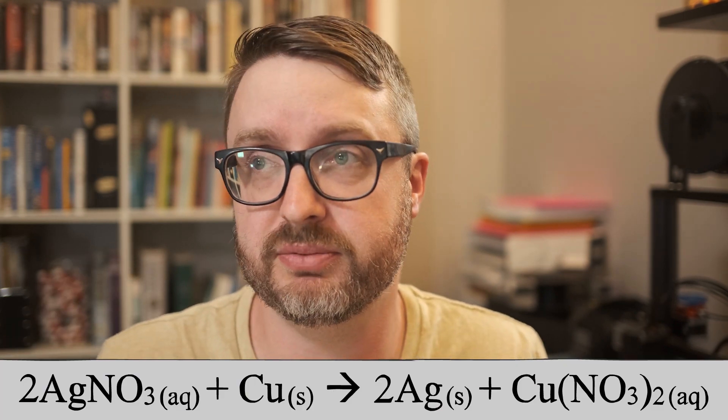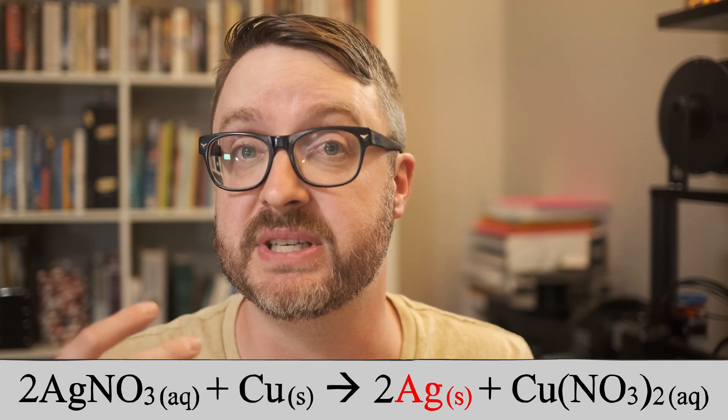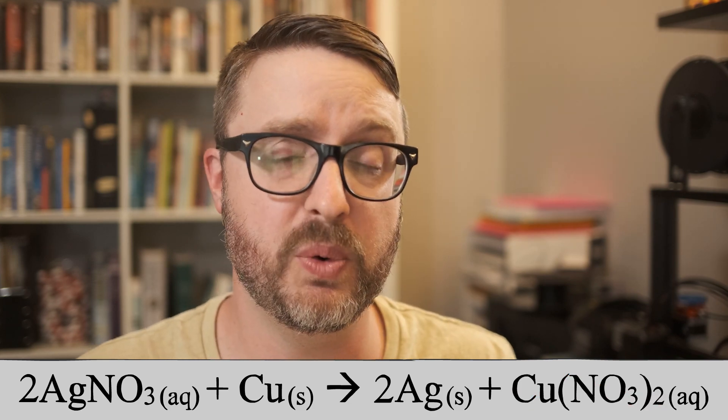As a chemistry teacher, it's my job to help students understand chemical reactions, but I also feel it's my duty to help them see the beauty of chemistry. Take this reaction for example — a standard single replacement reaction between silver nitrate and copper metal that produces silver crystals and copper nitrate. To really capture its beauty, I connected my camera to a microscope, and I was astounded by the footage. I want to show you the reaction, and then two things that even I — a person with a chemistry degree — learned from watching this amazing footage.